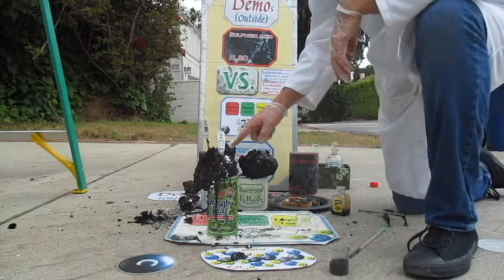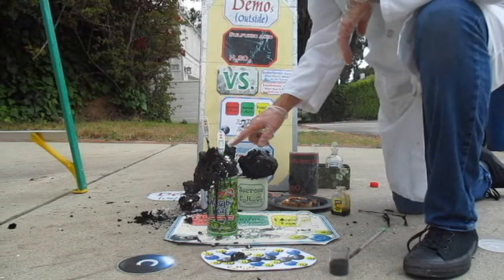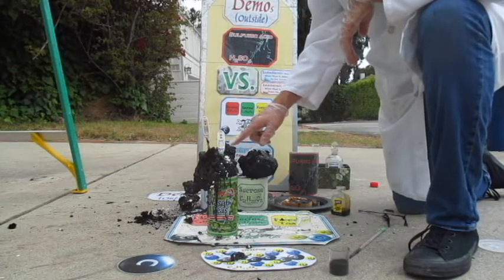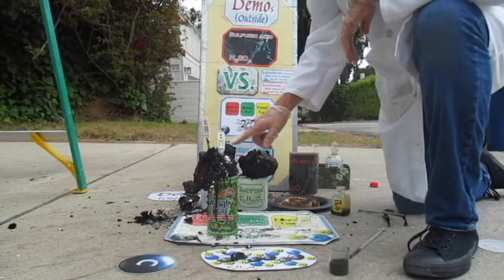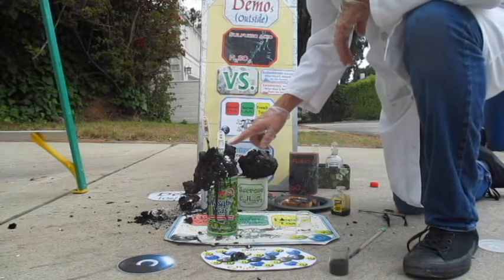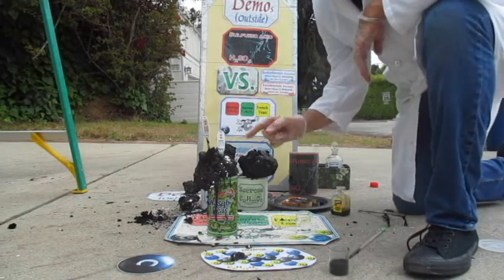147. So it's funny, they reach the same temperature. This one's still going up though, so it might get a little higher. Interesting. I'm gonna call it at... oh no, it's still going up, 147.8, 0.9. I'm just gonna have to call it at 148 degrees Celsius.